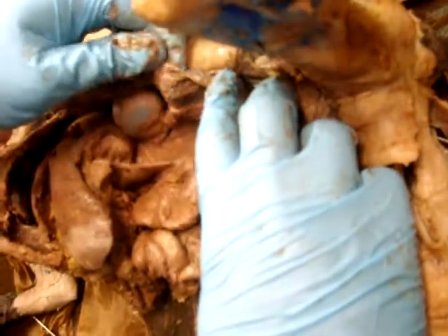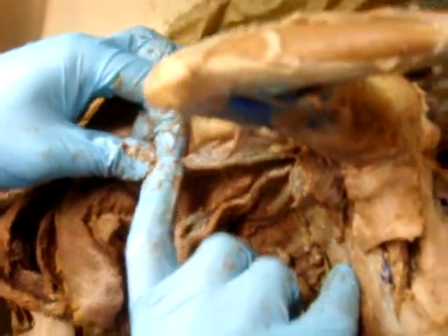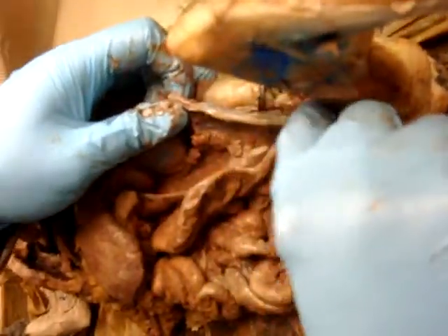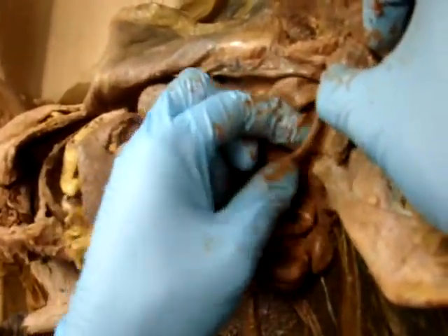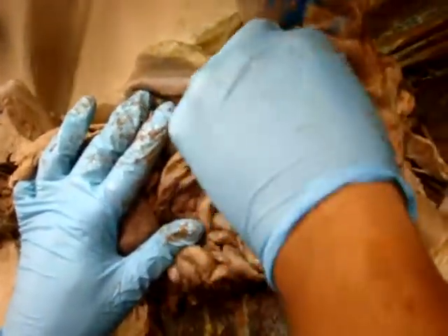And inside here, that little dot, that's the ovary. And there's a little tiny oviduct that takes it to this part. This is actually not the fallopian tube. It is the horns of the uterus. Here's the body of the uterus. See, it looks like a big V? These are not tubes. Because they hold many kittens, they go along there, and that's how they can have them.